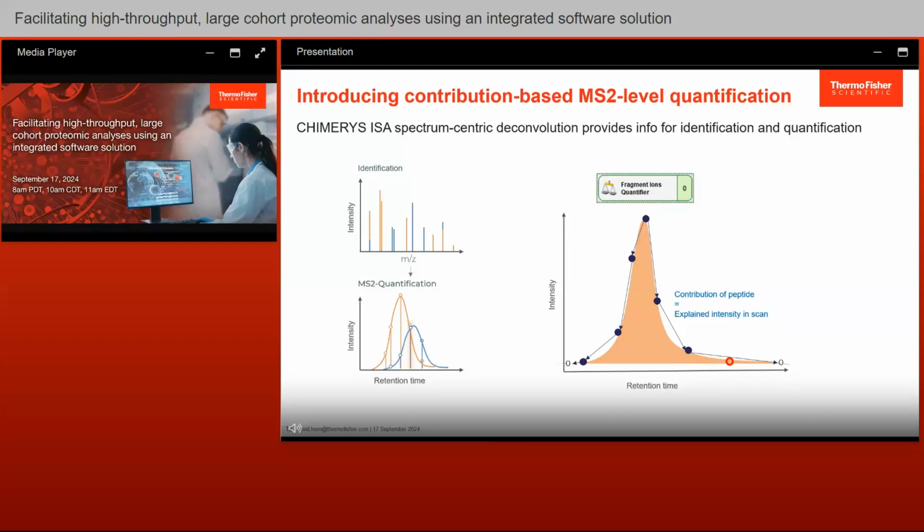Proteome Discoverer software treats these quantitative values similarly for DIA as it does for TMT and LFQ, rolling up the DIA precursors to peptide and protein quantitative values.